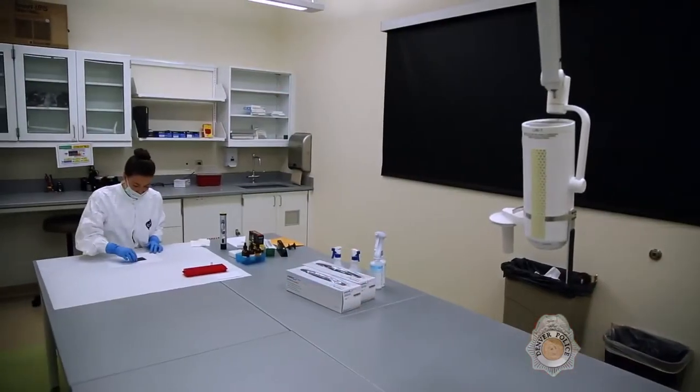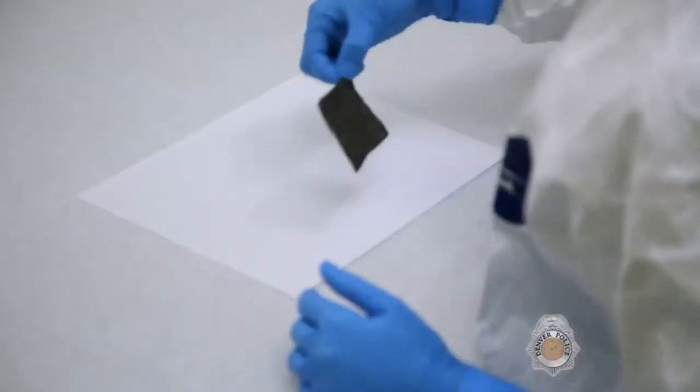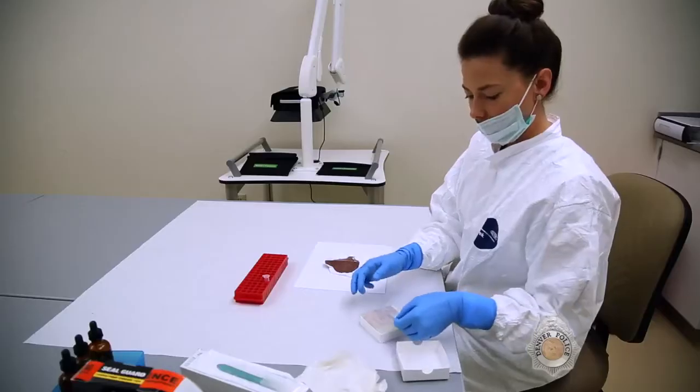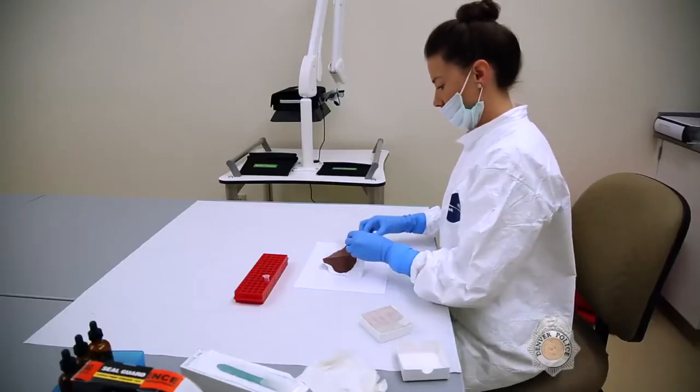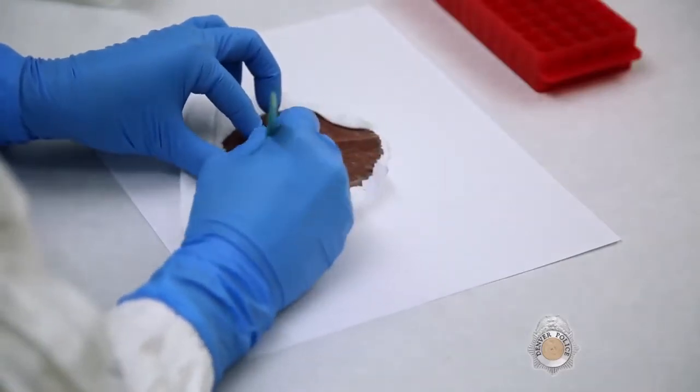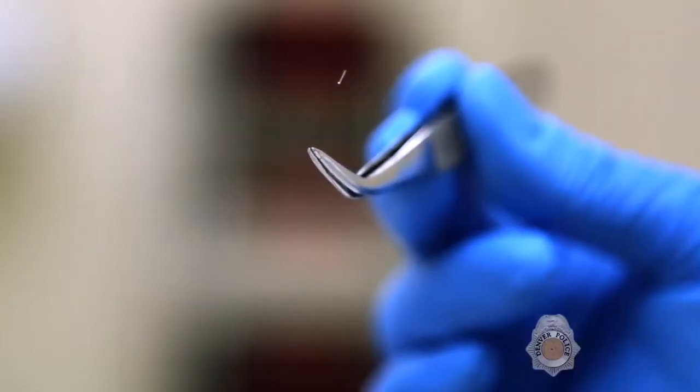Work in the Forensic Biology Unit begins with a visual examination of evidence for staining. Biologists take samples of potential stains to test for the presence of blood, semen, saliva, or cellular material. Hairs can also be tested if they contain roots suitable for DNA analysis.